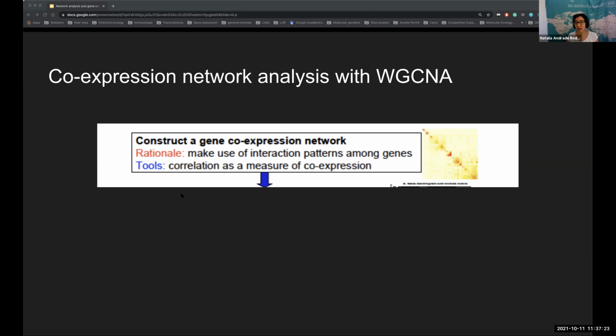Do you want to get all your transcriptomic data into a network, or do you want to find a threshold of expression? What does it mean if you don't eliminate certain low expressed genes for your network and for the following analysis?